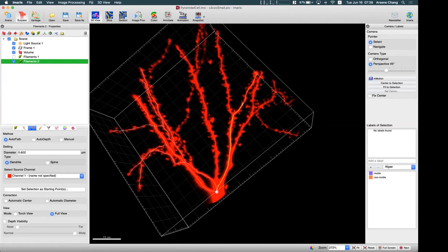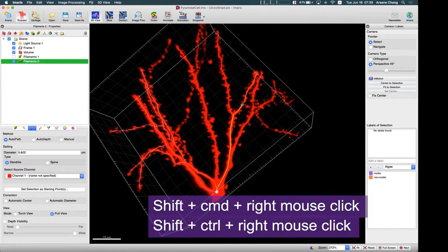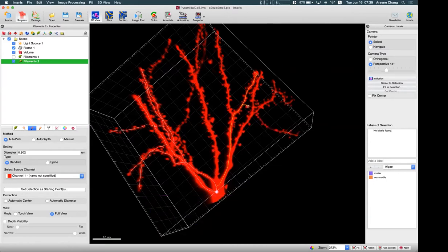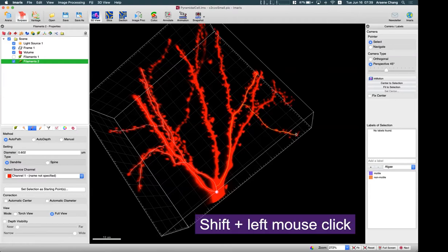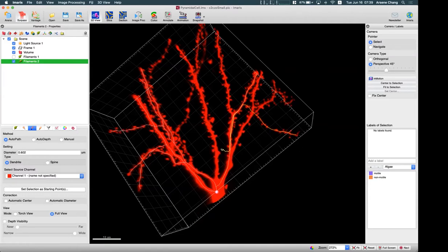Instead of making a new starting point, hold Shift and Command and right-click on the branch. This lets you redo and draw that branch easily from the branch point. Then hold Shift and left-click again to finish the trace. This is one way to correct a false route.